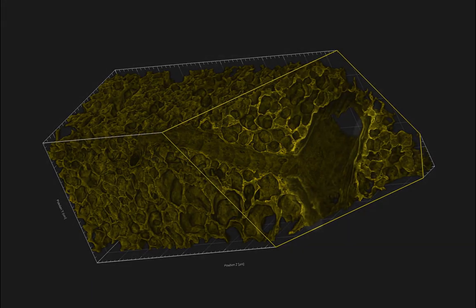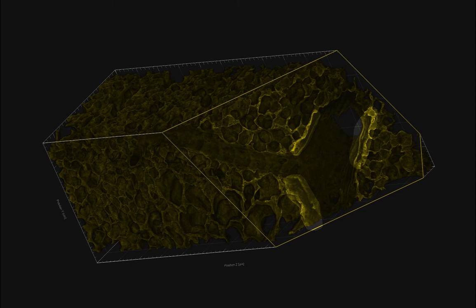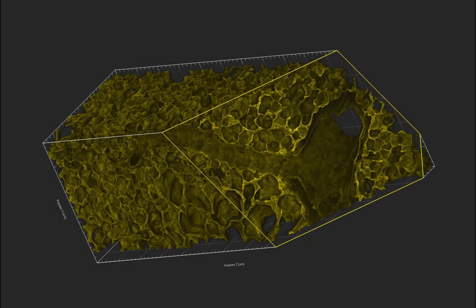Another interesting feature is this space. This has not been visualized well before. We think this is the lymphatic space, where the lymphatics are draining alongside the pulmonary veins. And that's very important for the balance of fluid in the tissue, being controlled by Starling forces.